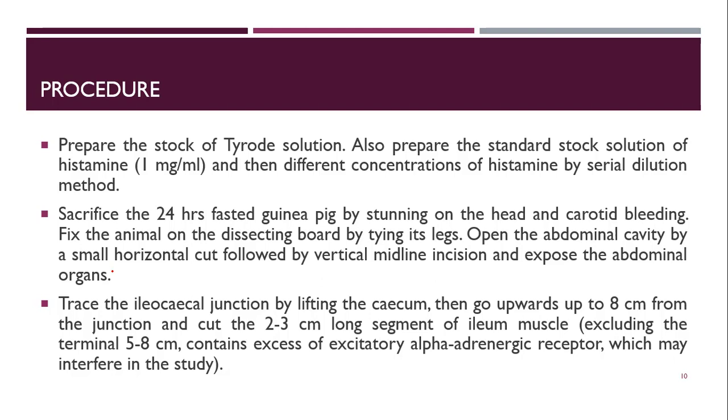Okay, and then we have to go upwards up to 8 centimeters from the junction, and we have to cut 2 to 3 centimeter long segments of the ileum muscle, and we have to exclude the terminal 5 to 8 centimeters, which contain excess of excitatory alpha adrenergic receptors which may interfere in the study.